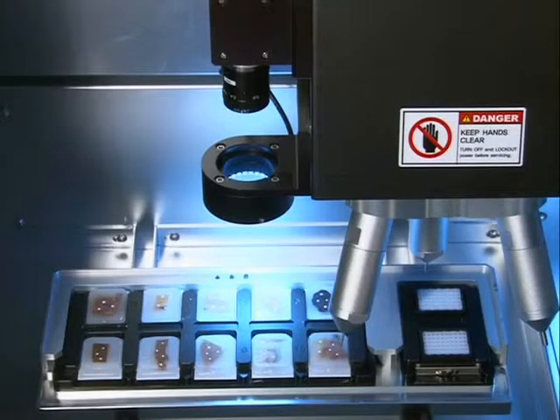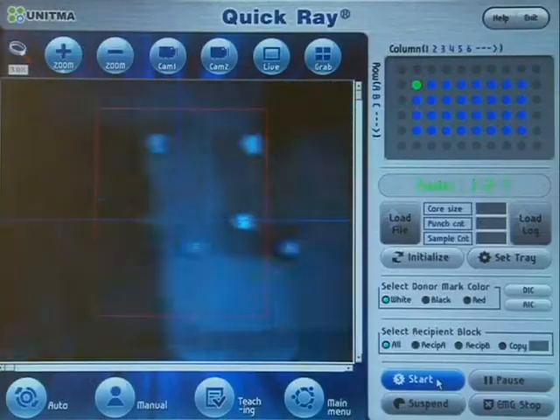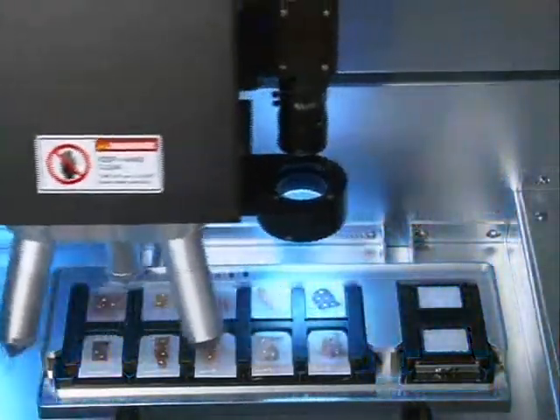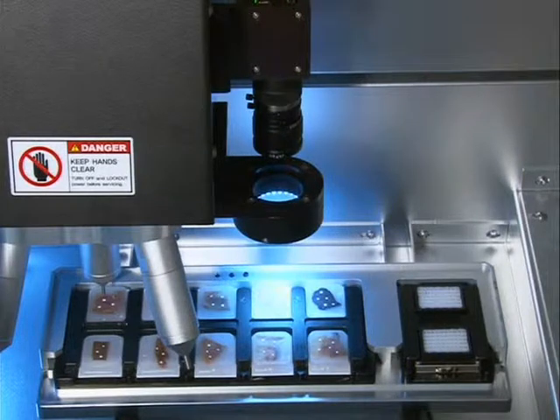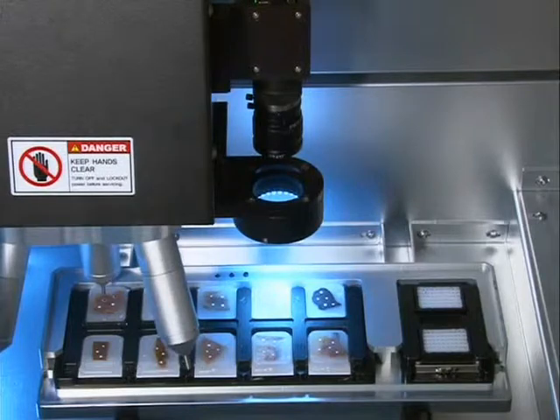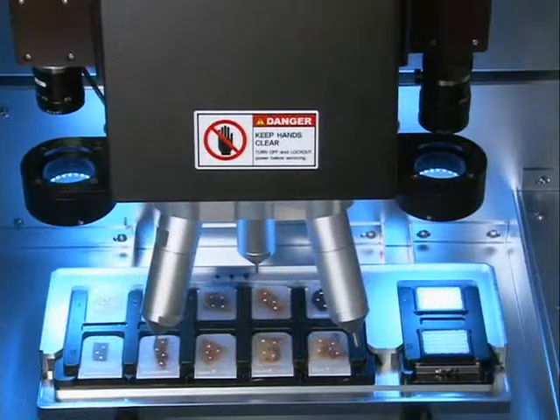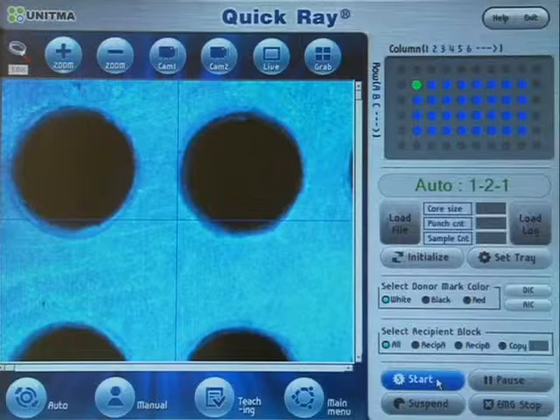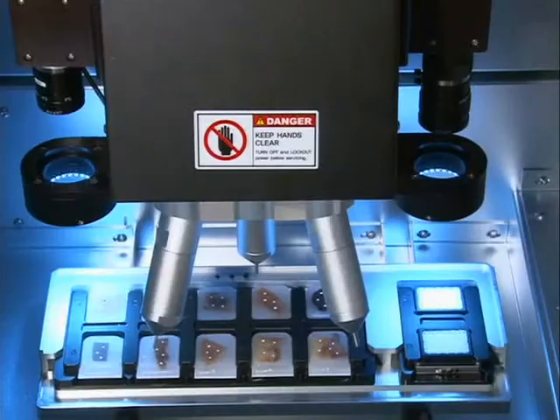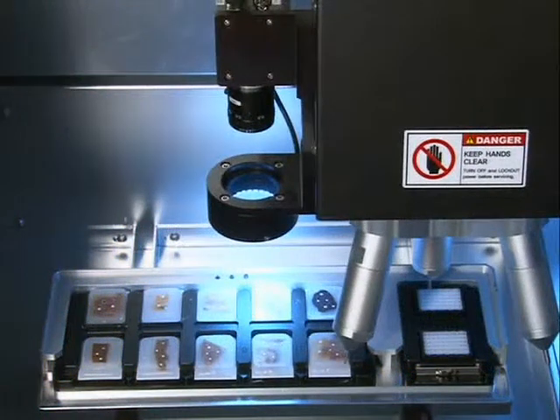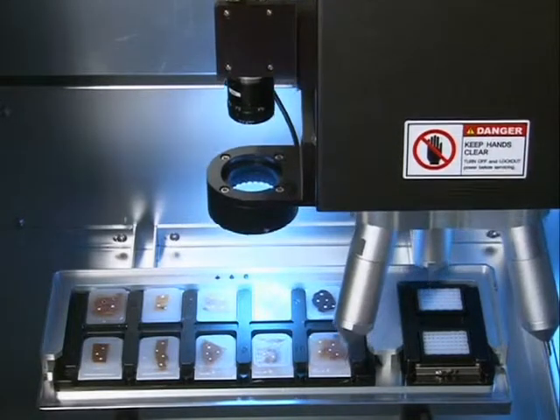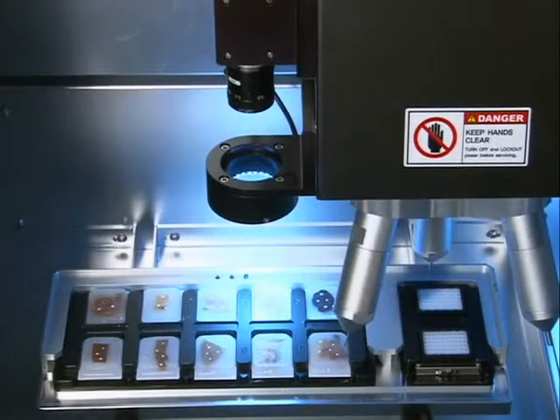First, the camera moves to a donor block. Second, acquire a donor block image. Third, calculate the coordinates of the donor block tissue sample. Fourth, pick up the sample using a tip. Fifth, the camera moves to a recipient block. Sixth, detect the center of the corresponding recipient block hole. Seventh, move to the calibrated coordinates of the block. Eighth, insert the tissue sample. Repeat these eight steps until the process is completed.